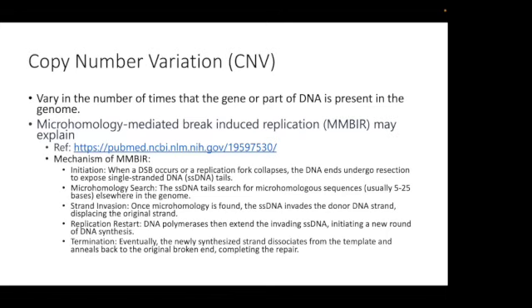And then you break your DNA and let it hybridize. If it's in a certain kilobase or certain megabase region where there is a copy number variation, that may have double copies or triple copies, then the average intensity is, let's say, 1.7.